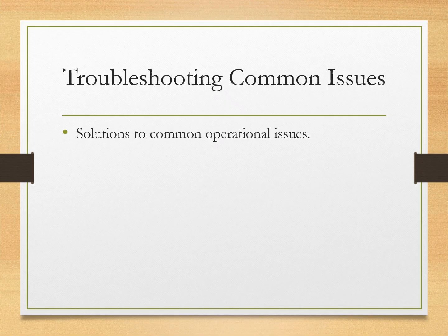Common issues include noisy spectrum, wrong baseline, dirty cuvettes or concentration outside the linear range. Proper maintenance solves these problems, so troubleshooting problems can be solved.